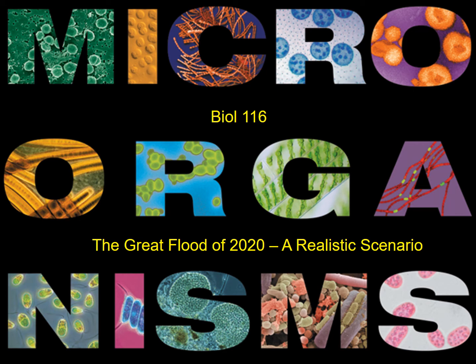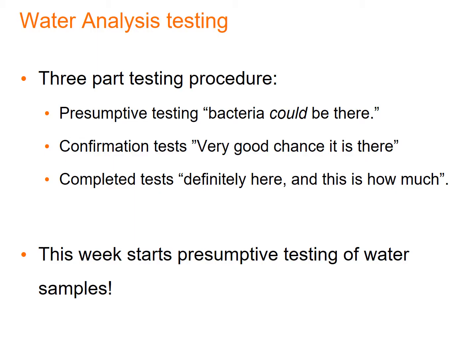All right, this is the Great Flood of 2020, a realistic scenario that we're going to use for you to demonstrate your skills and understanding in microbiology to answer some real-world questions. In video 3, we introduced the idea of water analysis testing. Now, water analysis testing can be very, very expensive, and many times we're testing many samples.